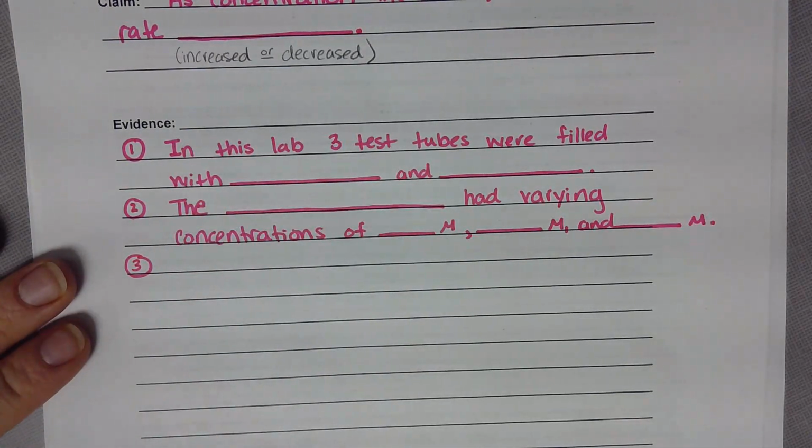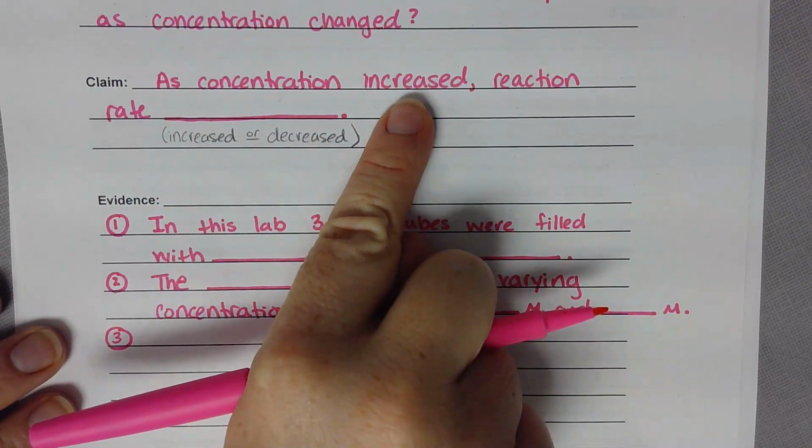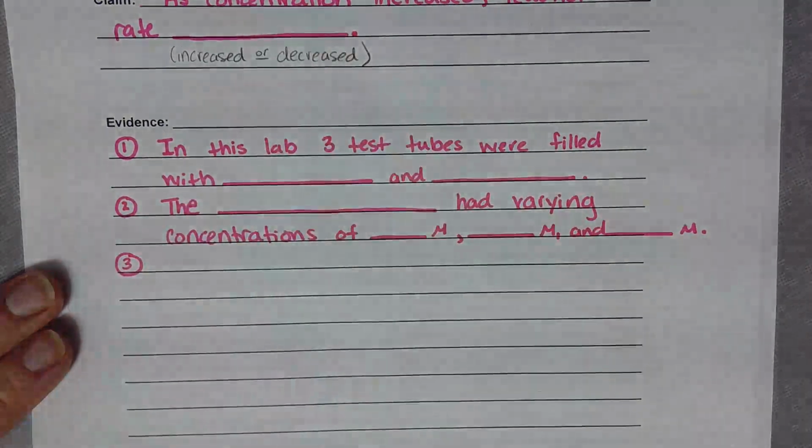Now, we picked increasing as a perspective. So we're going to talk about the increasing test tube and the fast reaction.